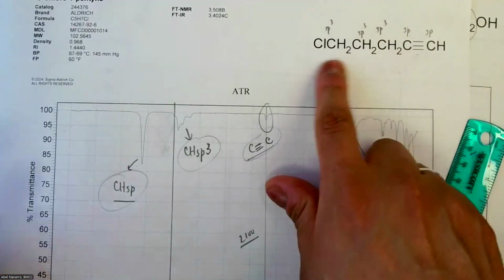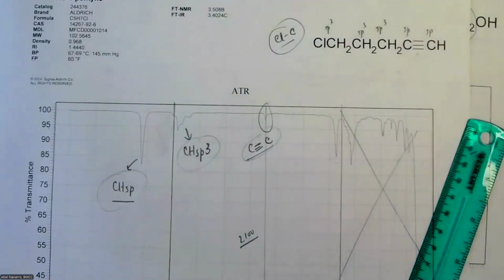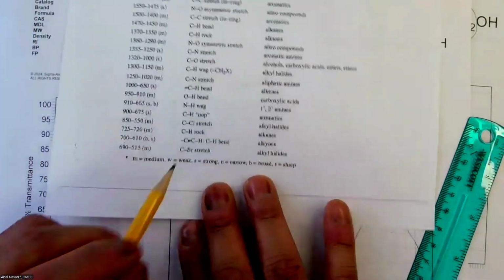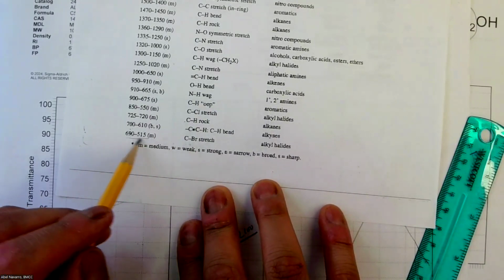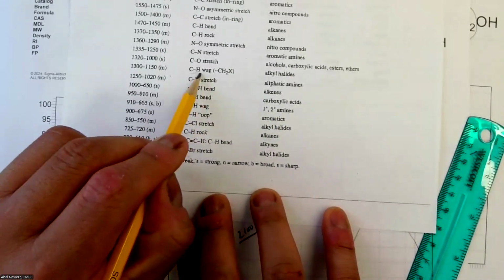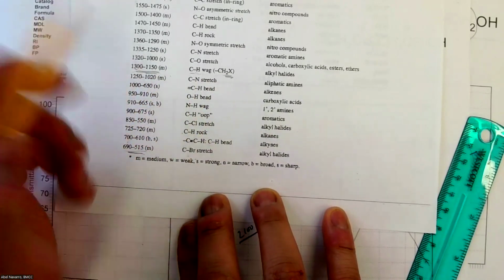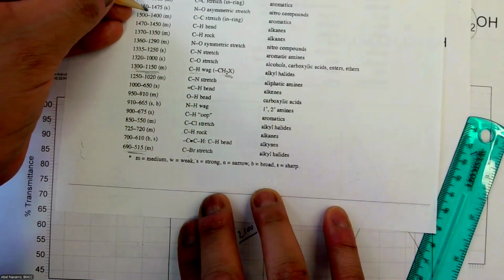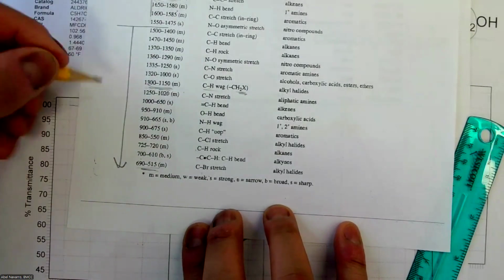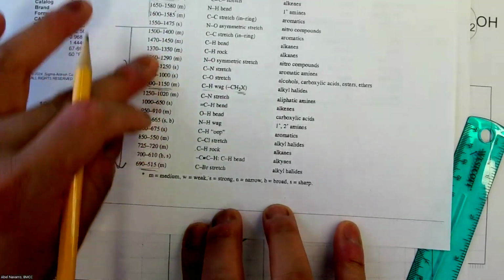I assign everything. Professor, do you see C-Cl in IR? Let's see. According to the reference table, do I see C-Cl? I see C-Br, but at very low wave numbers. So fingerprint, no, you don't see it here. C-X with a halogen, an alkyl halide, is also in the fingerprint region. So these peaks, unfortunately, we lose them. From this side to this side, this is all fingerprint, so you don't even really have to bother looking at these peaks.